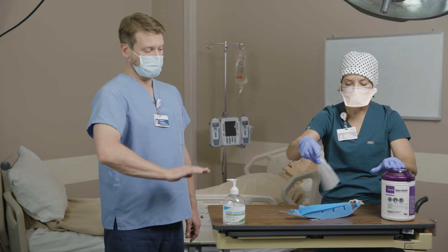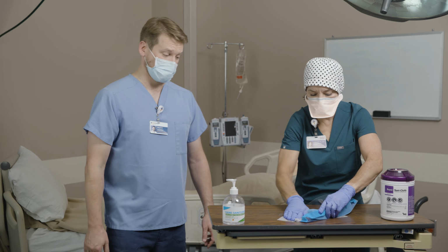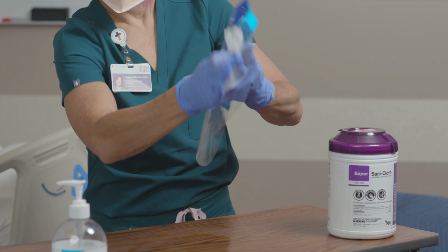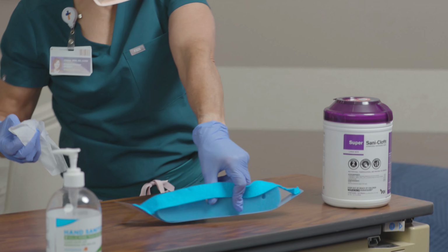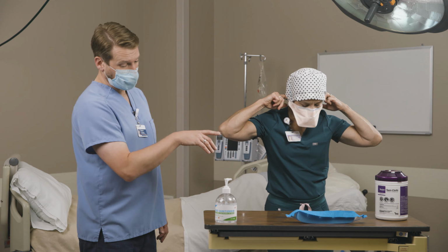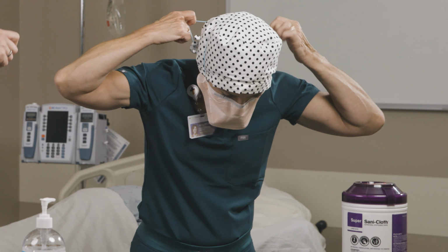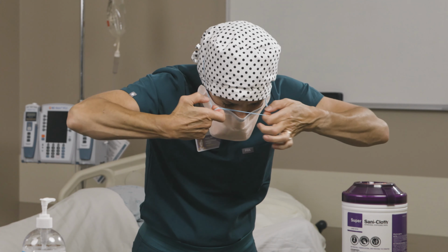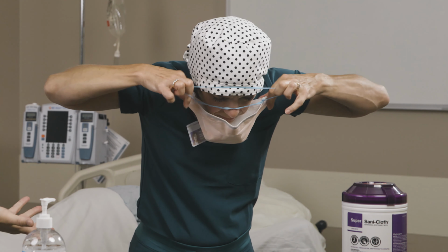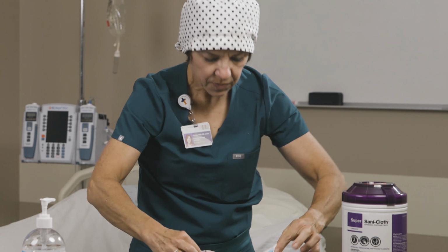She's going to take another wipe. She's going to disinfect the face shield. Now that's been wiped down and it'll be there for its disinfecting contact time. She's going to doff her N95 mask. So she's going to do that by pinching the bottom strap first and bringing that up over her head, and then moving the top strap. And this helps prevent that N95 from falling down into contact with the caregiver.